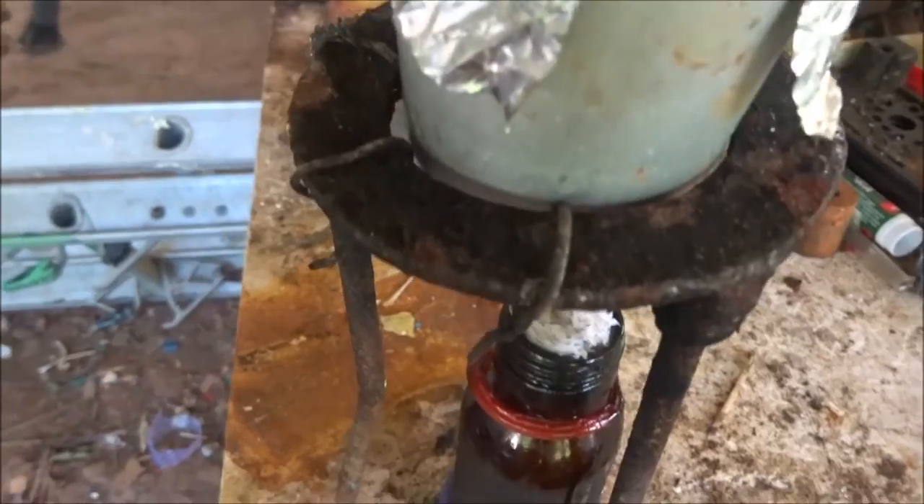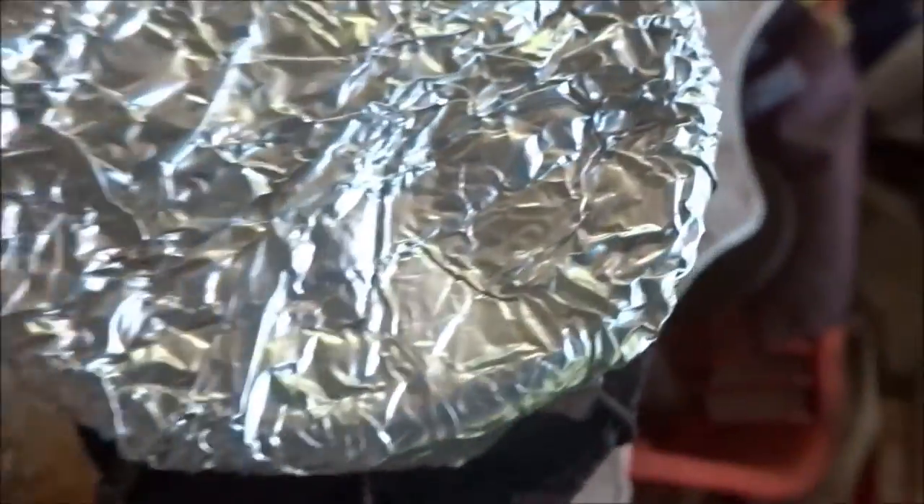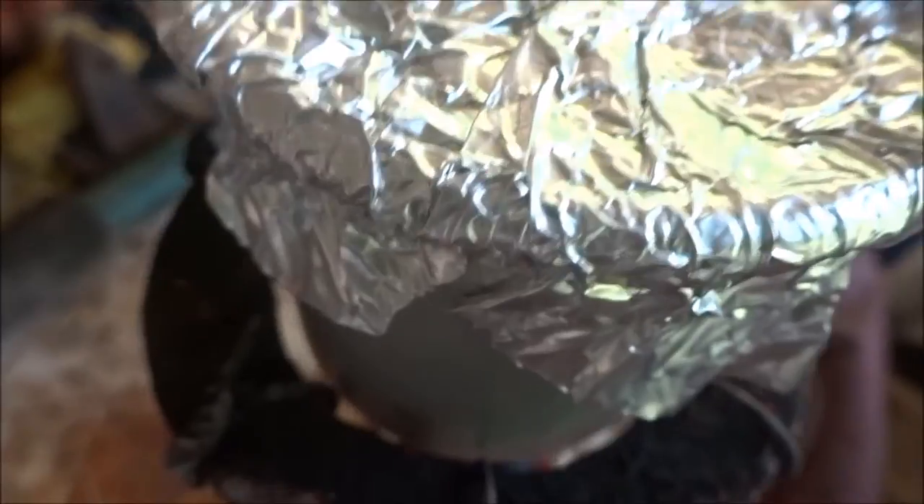Once the copper chromate has been dried, load it into an aluminum pot to be heated and turned into copper chromite. Now I'll light the fire.